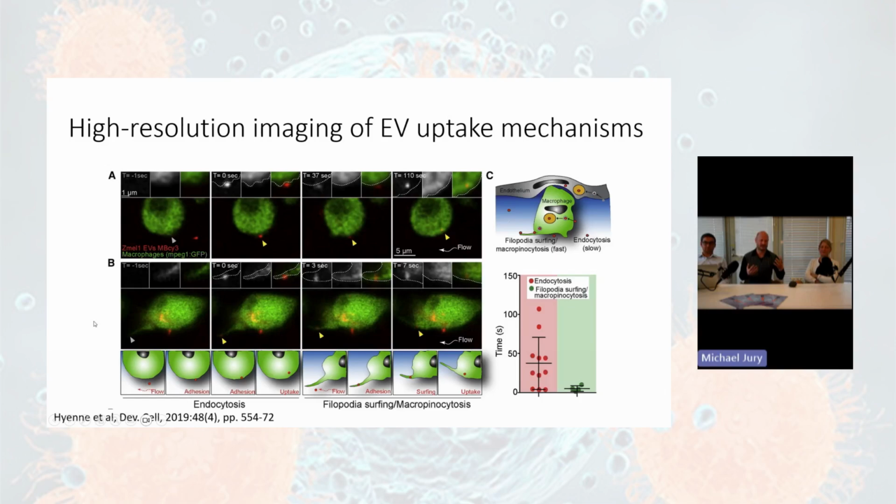So that's, I think, one of the main benefits with the Zebrafish system, that you can really get highly dynamic data that is difficult in other in vivo models, where it's often snapshots at a certain time point. It limits a little bit the analysis you can do compared to the dynamics here.